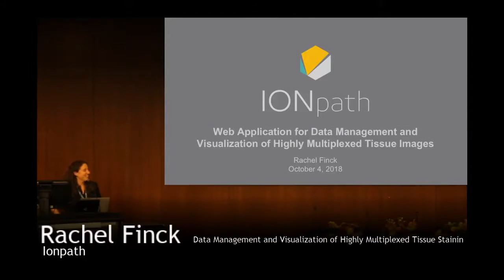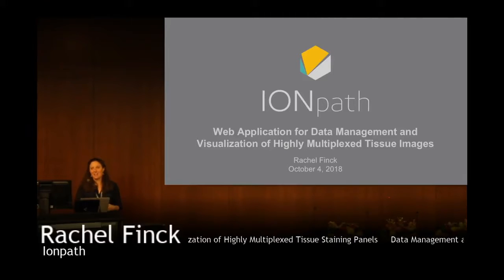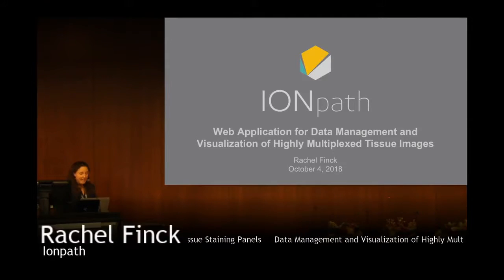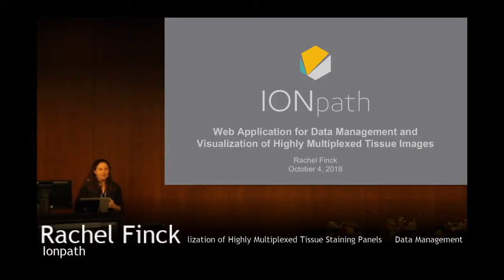Thanks a lot for having me today. I have the opportunity to speak after Liat, who talked so beautifully about the new technology and a particular application of it, so I'm going to talk about a completely different aspect of working with multiplex ion beam imaging data. I'm going to focus on data management and visualization through a web application. Although I'm going to do that in the context of MIBI, and in particular with an application that we've developed at Ionpath, I think many of you will find the challenges that motivated this familiar from any of the data types that all of you work with, and I hope you'll find the approach that we've taken to address them relevant.